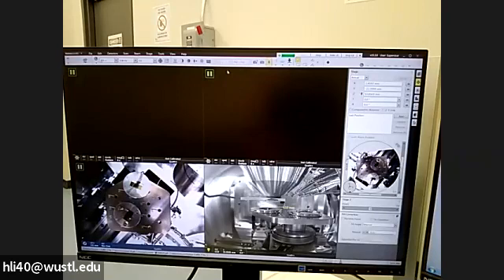So if you let the beam stay at one point for a longer or shorter time, that time is called the dwell time. So longer, you will get higher signal counts, but it also takes longer to scan the whole image. Also, if your sample is sensitive to the beam, you don't want a very long dwell time, as it will give you more damage. The next thing is pixel. It's called scanning resolution.